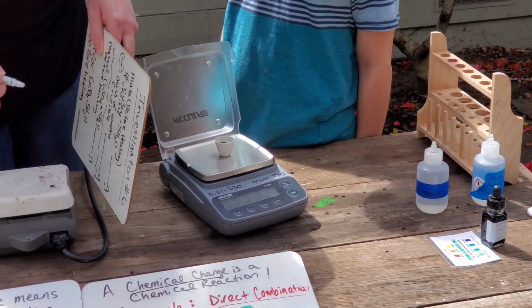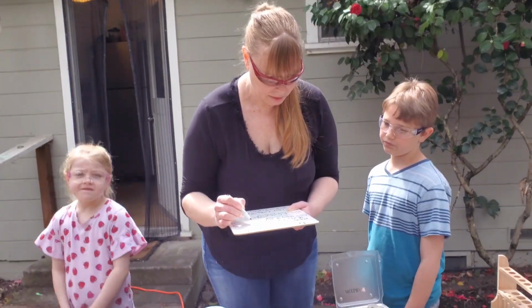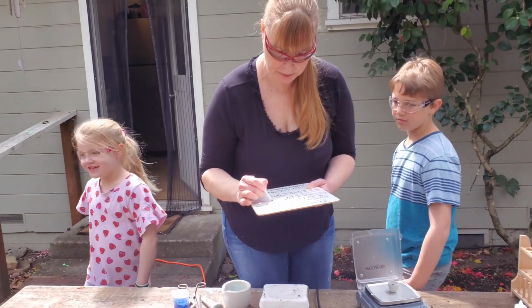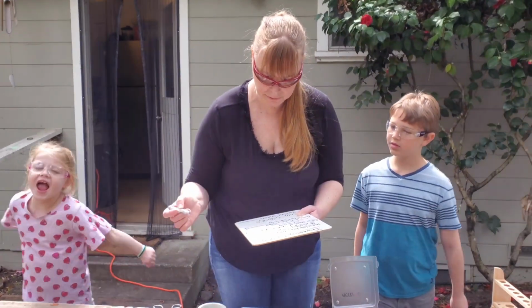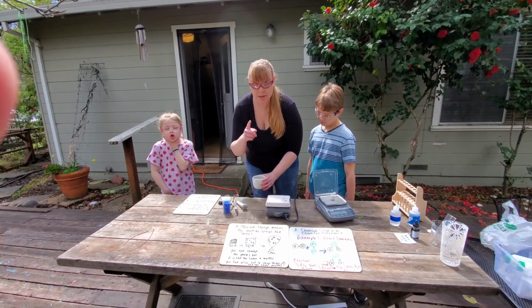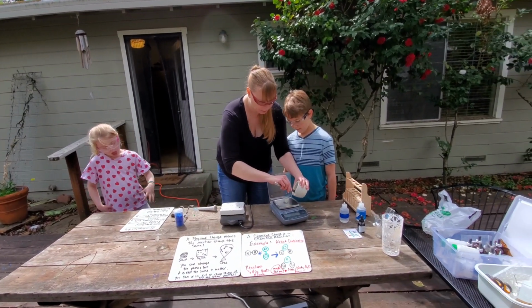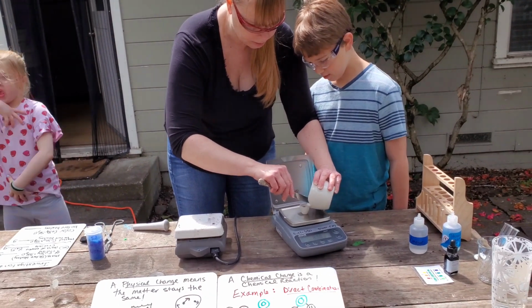Okay. Let's do 8.5, just because it seems to fluctuate. So mass of empty crucible 8.5. Then we're going to, you guys are writing that down too. So 8.5 grams. And then we're going to put some of the powder in.